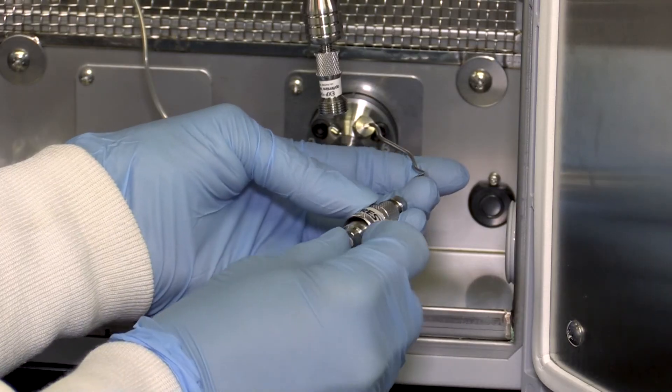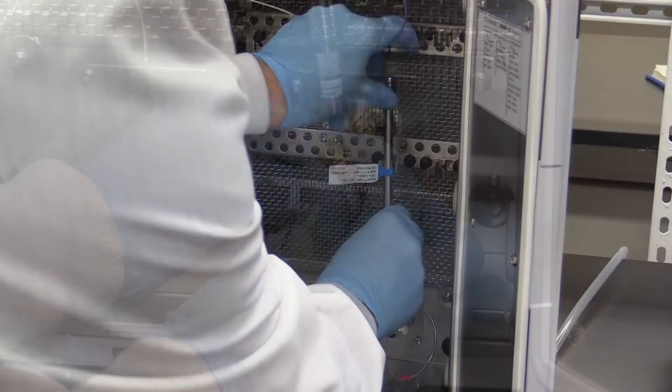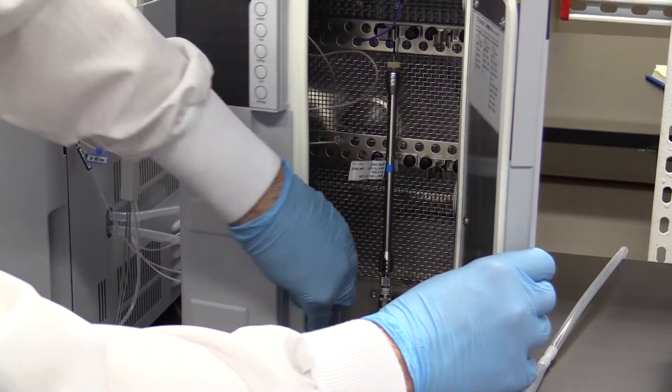For this method, we use a Raptor Arc 18 analytical column and guard cartridge. Place a Raptor Arc 18 EXP guard cartridge into the Direct Connect holder. Once you've established the method according to your lab's validation SOPs, now you're ready to run your samples and collect data.